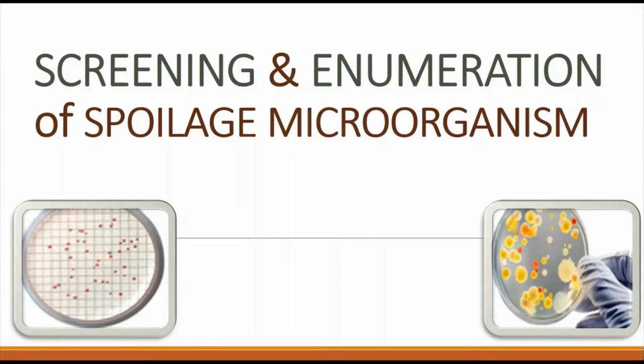Then what is meant by screening and enumeration? Screening is a type of procedure used to isolate, detect, and separate the microorganism of our interest from a mixed population by using highly selective procedures. So we can get the microorganisms from different sources like the environment, air, water, soil, and from food samples like meat, milk, cheese, etc.